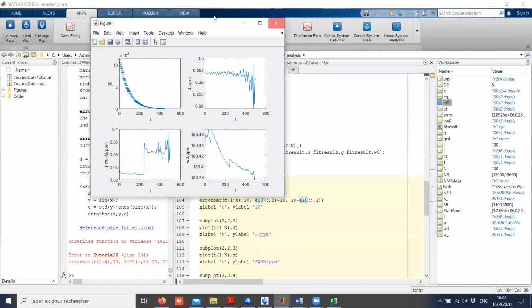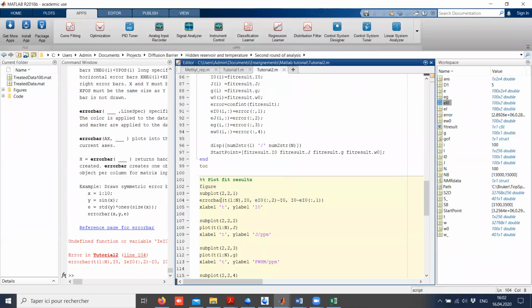I guess for me a more interesting way to plot it would have been this one. I finished with this. Instead of plotting it like this, we can have 3 lines. I write hold on so that it plots and doesn't erase the previous one. Then I have to hold off.